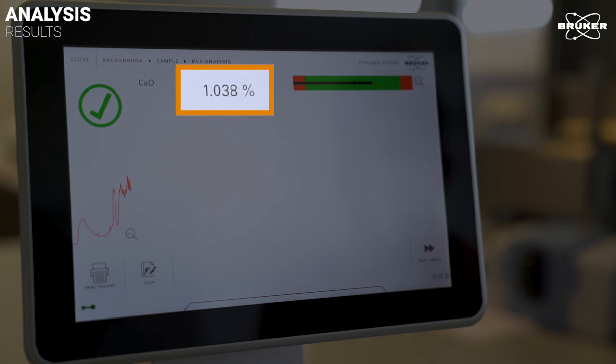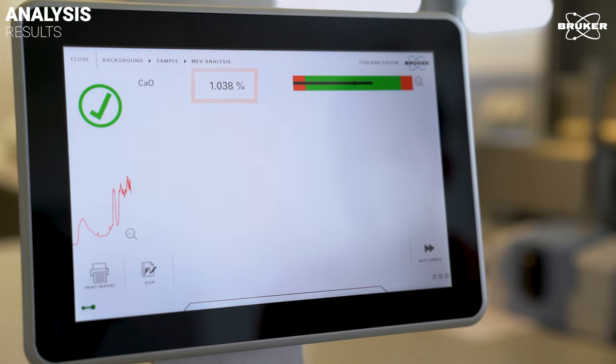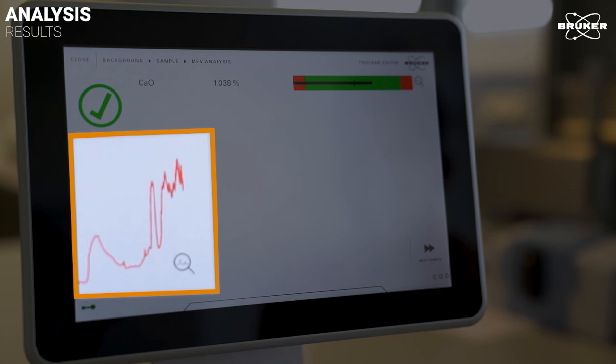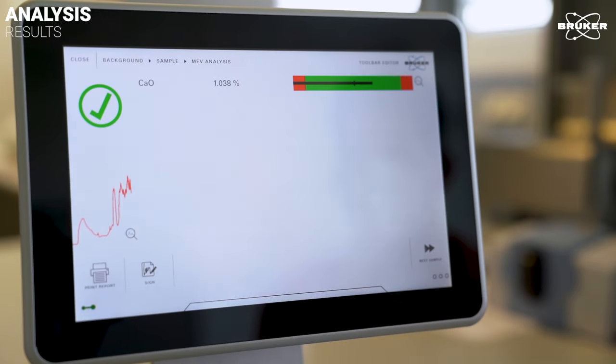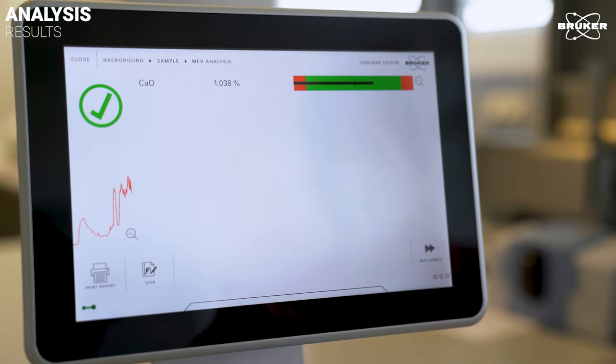So, the sample is just within the specified acceptance limits, which is shown in the graph on the top right. You can view the IR spectrum in more detail by clicking on the magnifying glass on the left or you can save the result as a PDF file under the Print Report button.